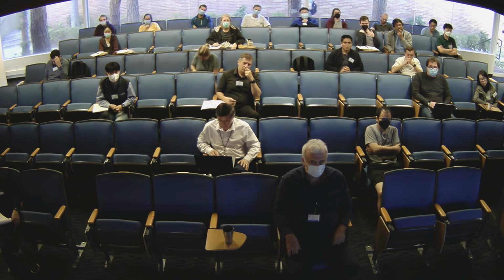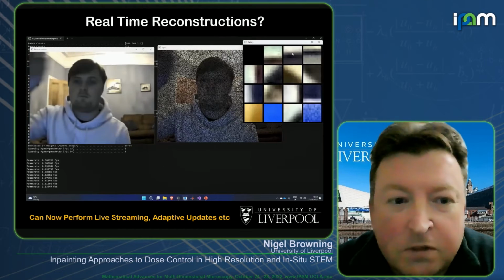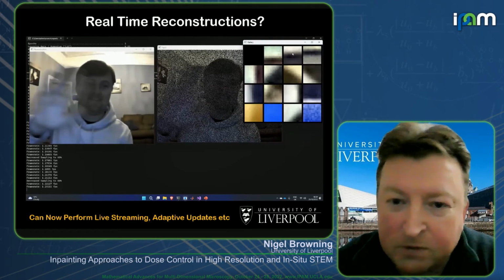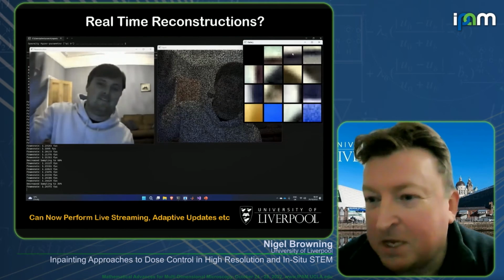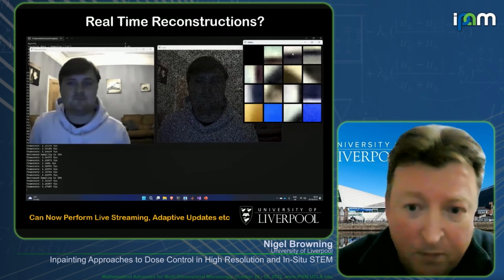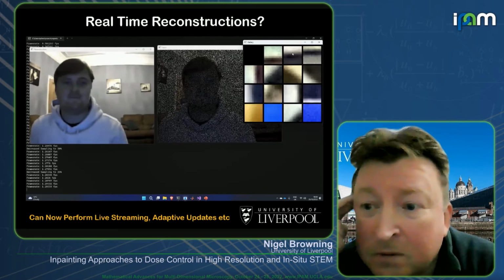No, as long as you have a certain sampling at that interface, then you wouldn't lose the resolution. Here, if you look as it goes to lower and lower sampling, because of the BPFA approach to the reconstruction, it actually doesn't lose resolution and it gets faster as it goes. Obviously, we can't go down to zero sampling and get a good reconstruction. There is a limit to how much you can go. But the approach seems to get down to somewhere between 1 and 10% of the sampling and still get the spatial resolution that comes out.